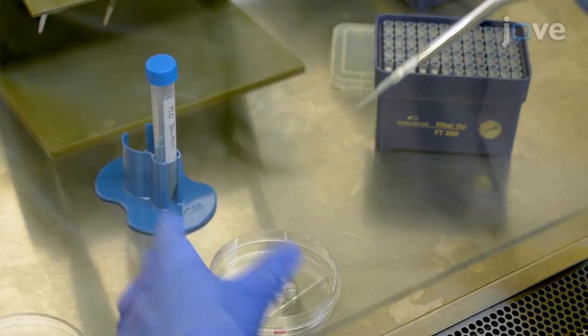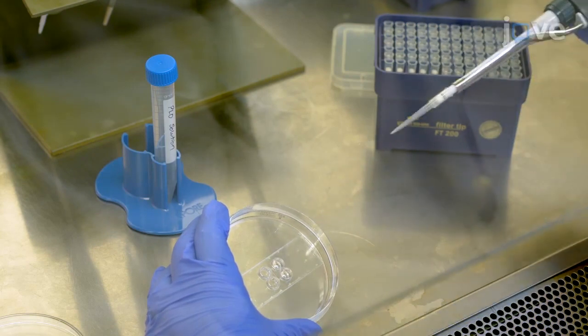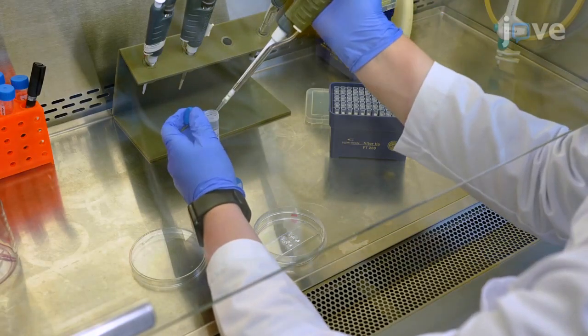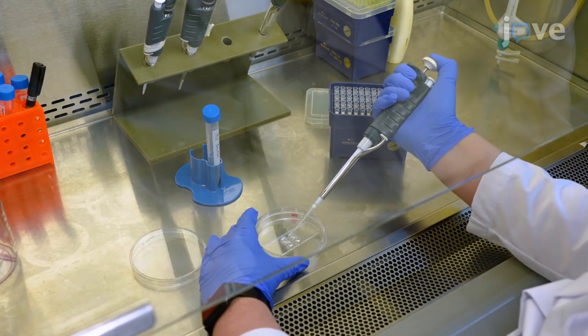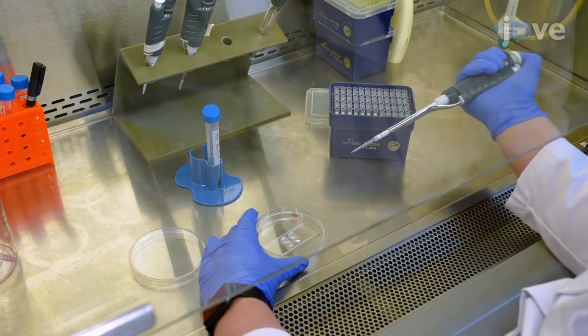Then add 100 microliters of PLO solution to the bottom well and repeat on the other side of the microgrooves. Finish by adding 100 microliters of PLO solution on one side to create a volume gradient between the two mirrored sides of the device to coat the microgrooves.